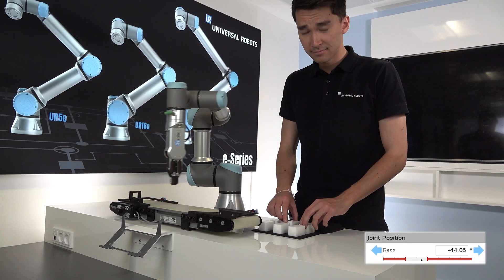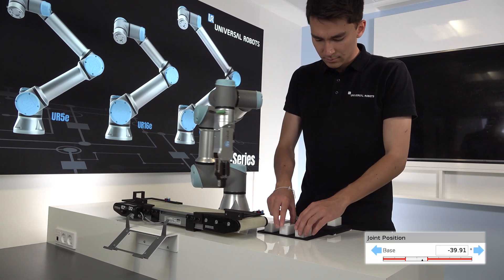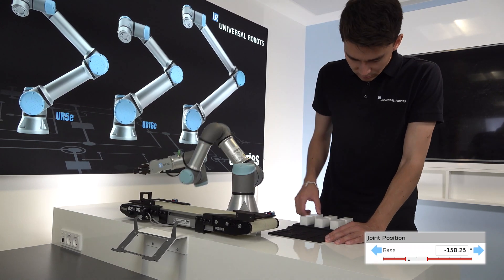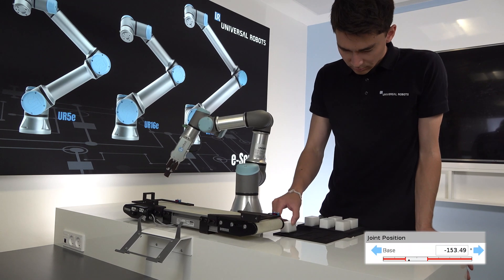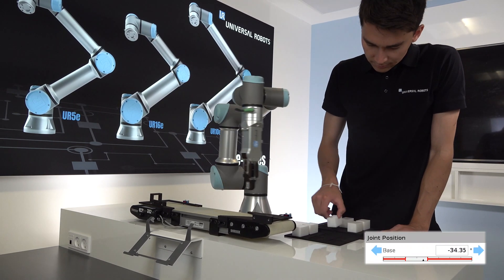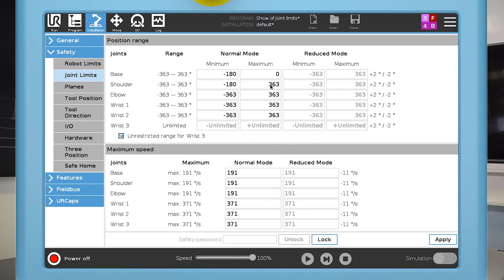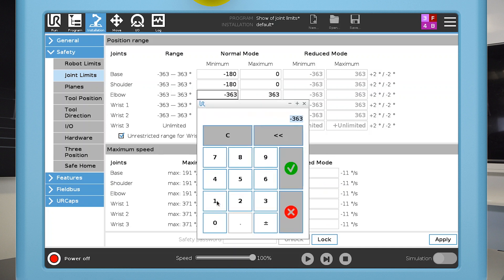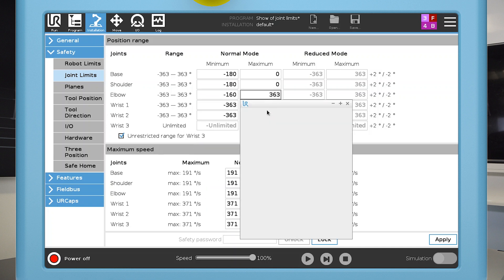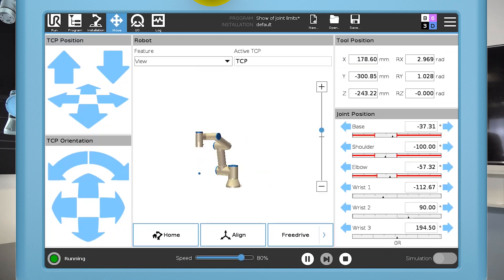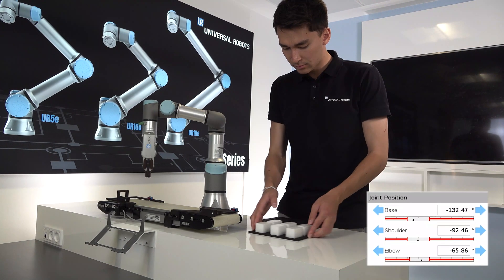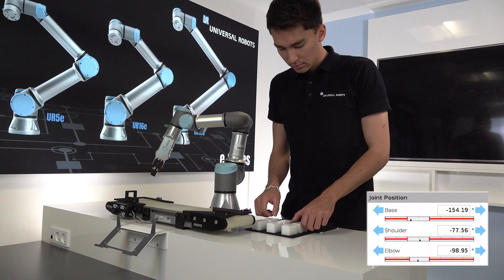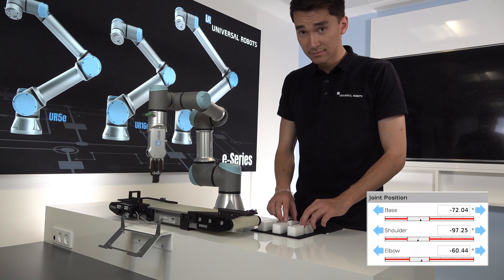The base joint is now prevented from turning towards the operator area. Next, I'll limit the shoulder and elbow joints. You can continue with the last three joints to completely confine the robot to the joint space required to run the program.